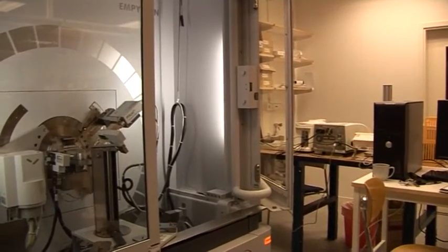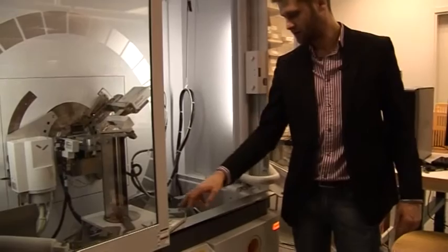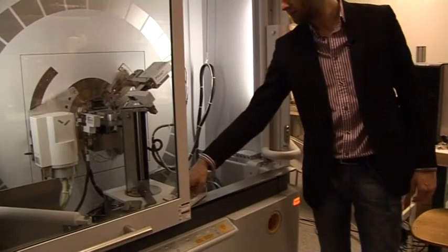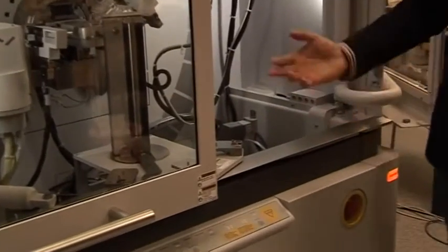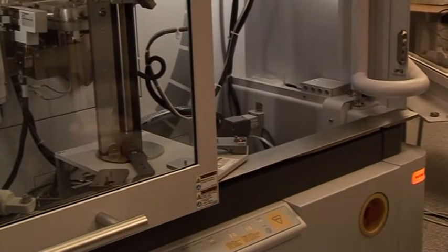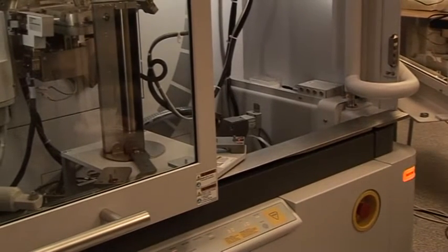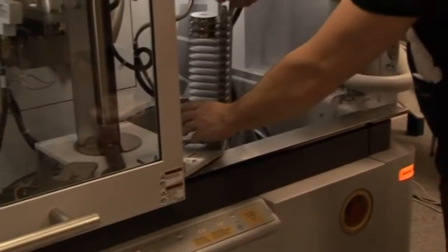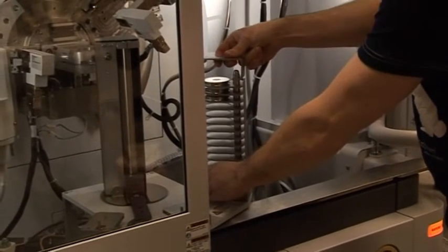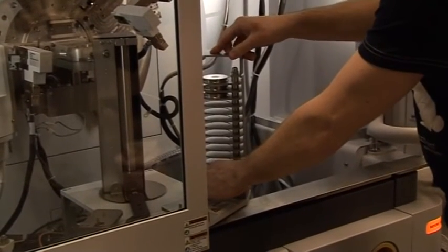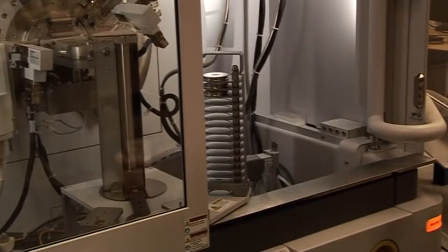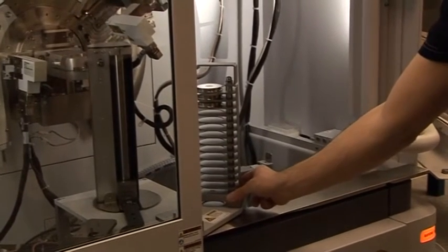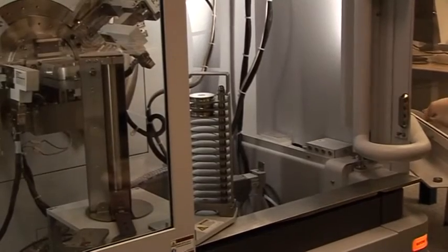Then you slide it out. As you can see here we have three available positions where we can put the sample changer, and they all have names: A, B, and C. I usually put it in A because it's the most logical. Then you make sure that it seats nicely. It doesn't look like there's any gap or anything, so it looks very firm. So then we can just close the door.